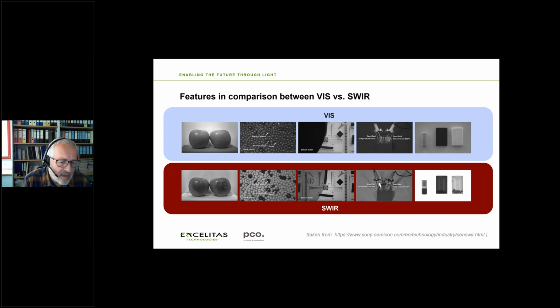This is more, let's say, a cosmetic argument, while on the next image from the left, the second one, you see beans. In the visible part of the image, you cannot separate the beans from pieces of metal, stone, or plastic, while in the SWIR image, it's pretty obvious. For these types of controls, like packaging of beans or rice, if there is something in this material that is not wanted, it can sometimes be easily identified, spotted and differentiated in the shortwave infrared.